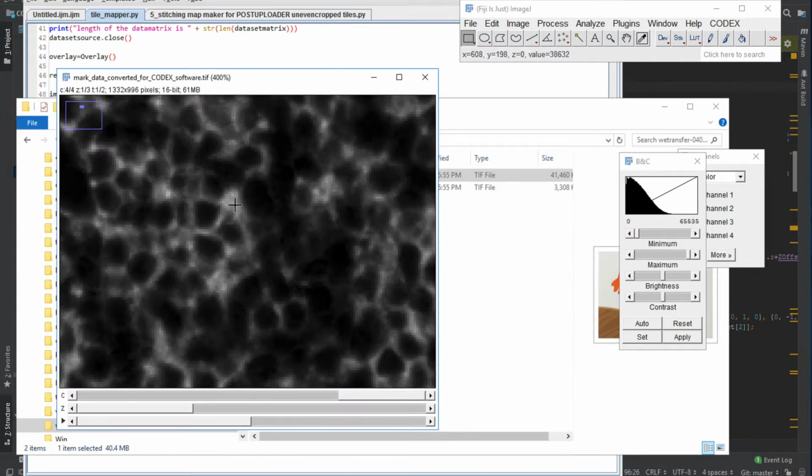Let's look at your CD45 signal. CD45 signal, you have 38,000 in the membrane. So in order to subtract, what we need to do is kind of equalize them a little bit during subtraction. So we need to take your 4,000 and convert to maybe 50,000, maybe multiply 10 times, and then subtract the membrane signal, right? And that will give you a final nuclear signal in the range of, I don't know, maybe 20,000 or so. We can do a couple of trials.